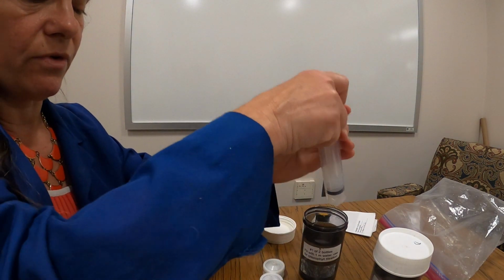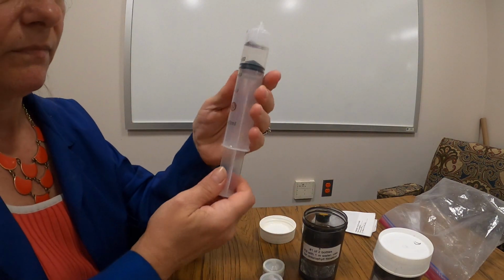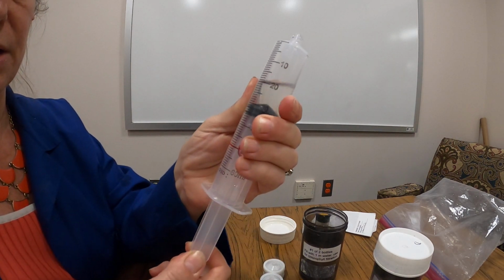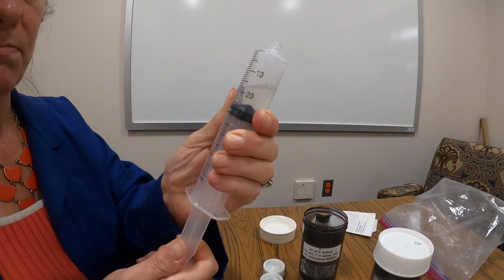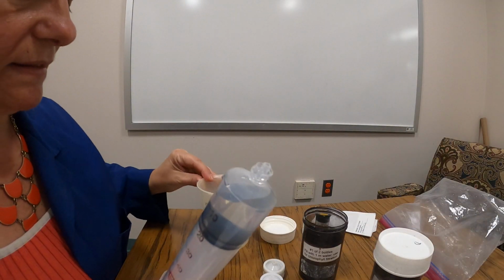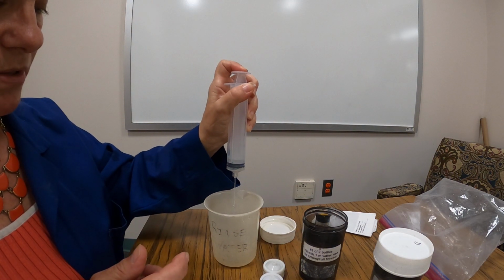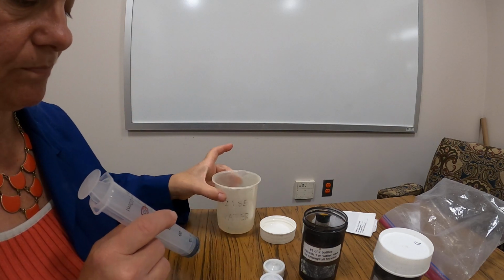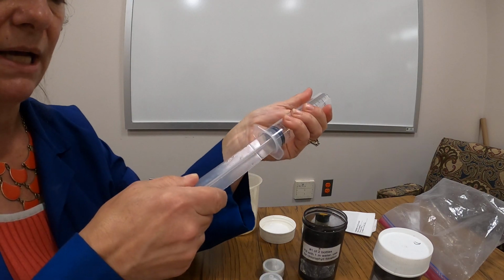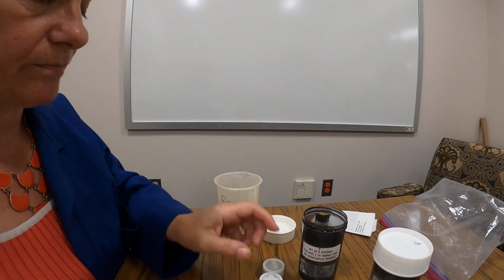I'm going to just draw up a little bit of water, and then I'm going to take that a couple times just up and down my syringe, and that's just to make sure that there's no dust or dirt or anything that we might have left from the last time. And I'm just going to get rid of this, just plunge the water out. And then I'm going to carefully pull back on the plunger and then pull it all the way out, and you'll get that nice popping sound.